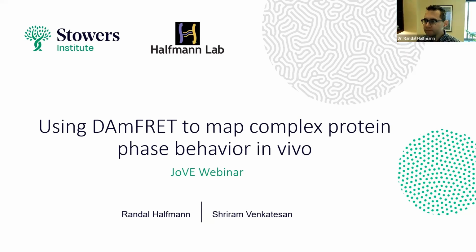Thanks for the introduction. I am eager to share with you some updates to the protocol, the procedure that we published with JoVE in 2019: using DAMFRET to map complex protein phase behavior in vivo. Of course, I'm Randal Halfmann, an associate professor at the Stowers Institute. I'm also asking my postdoc, Shriram Venkatesan, to be here as well.